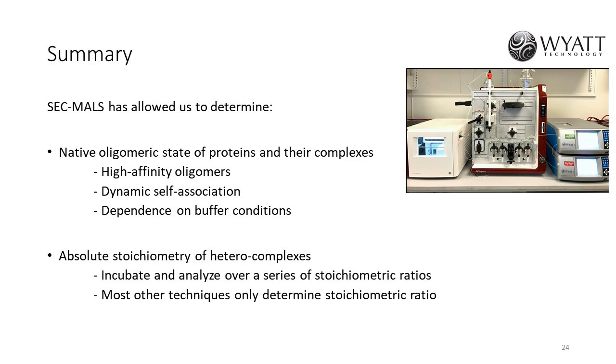This is also a really good question. I'll start with an example. The NAP1 H2A-H2B structure that's currently available, from the Poon group, is of the yeast NAP1 core domain, a tailless construct of the yeast NAP1 protein, interacting with H2A-H2B. So that's the crystal structure available.